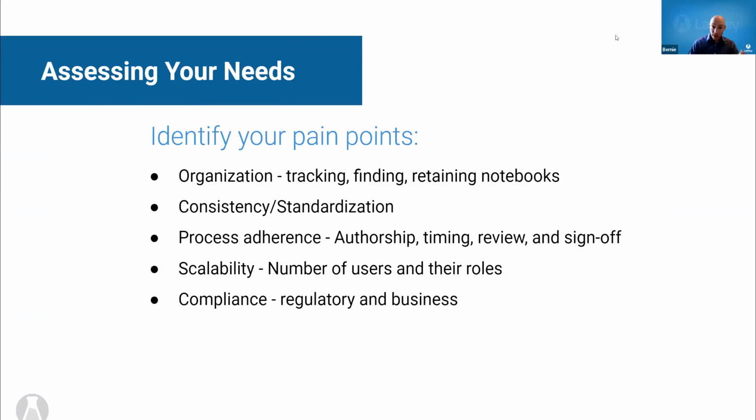Now that you have a better grasp on what distinguishes the various tiers of ELN, it's time to start figuring out how to choose one. So choosing the right ELN certainly depends on your needs and resources. So, this problem begins with identifying your existing and prospective pain points.